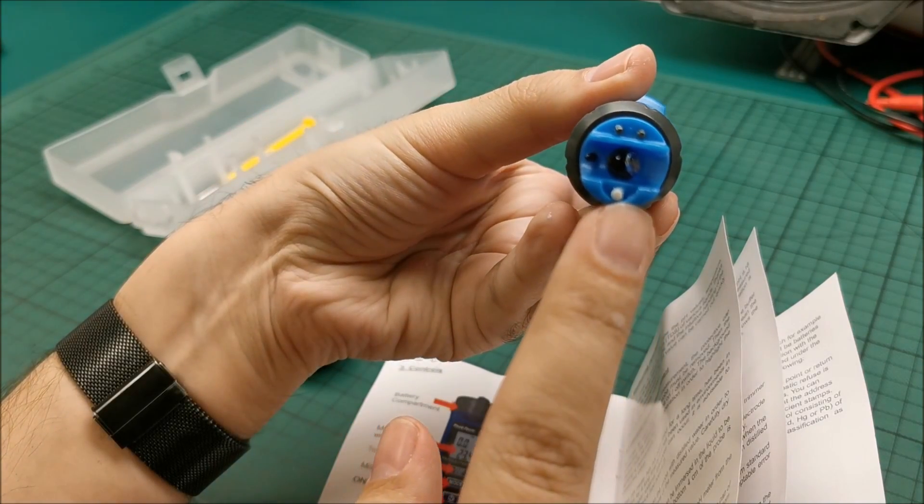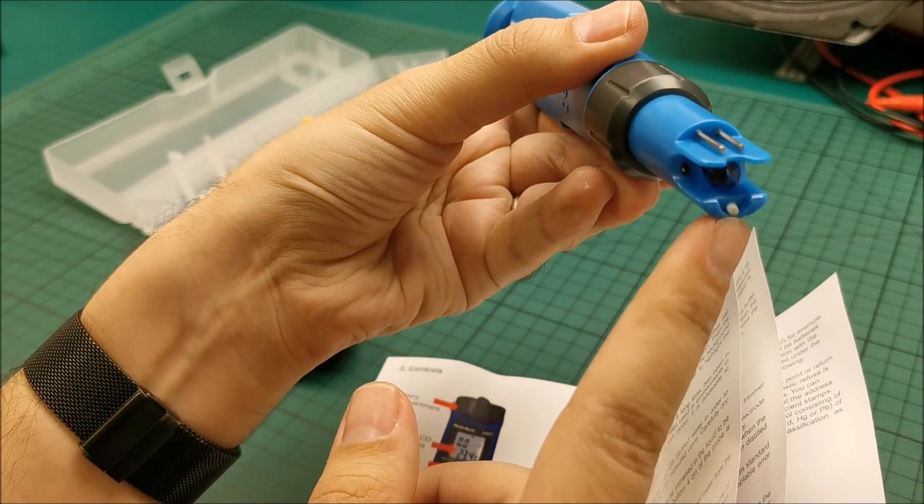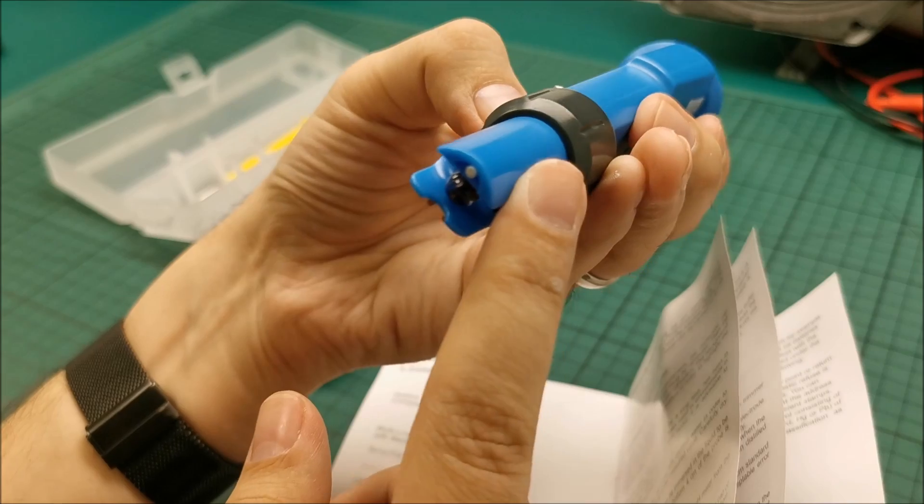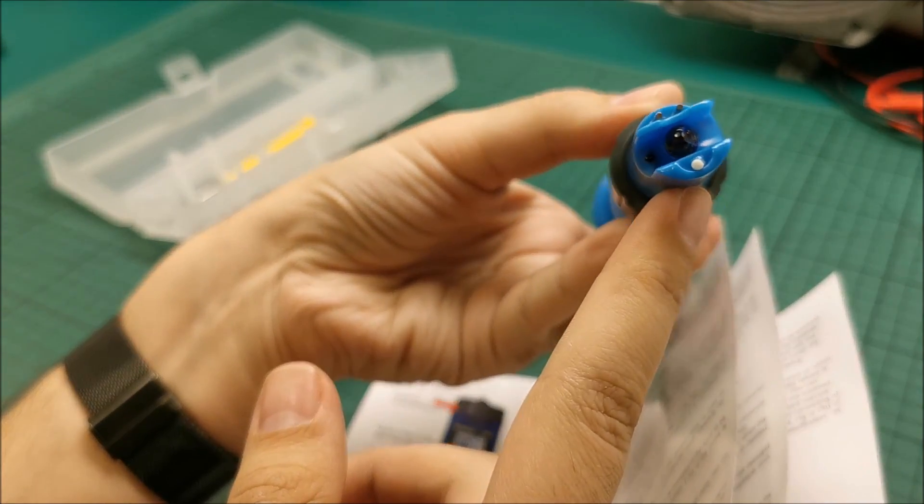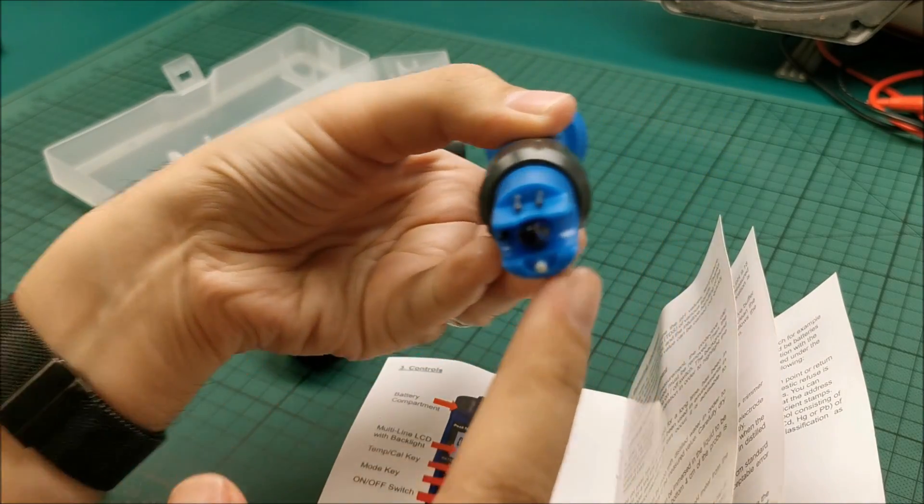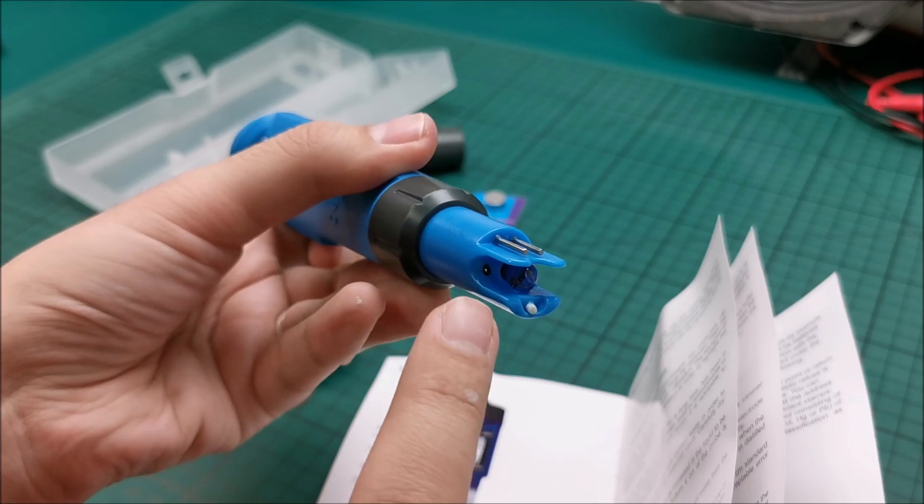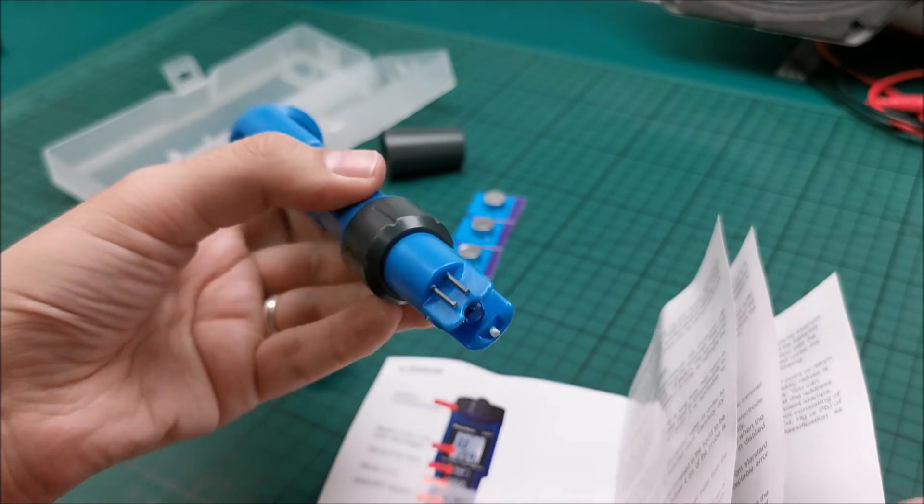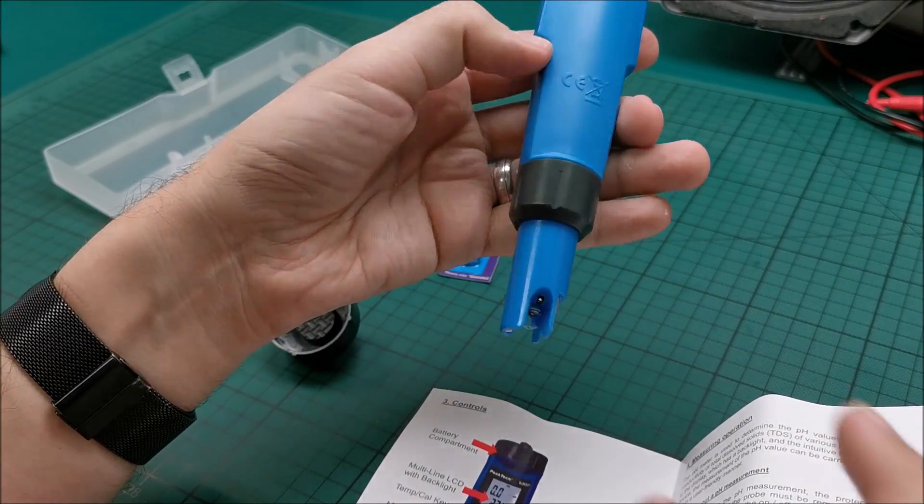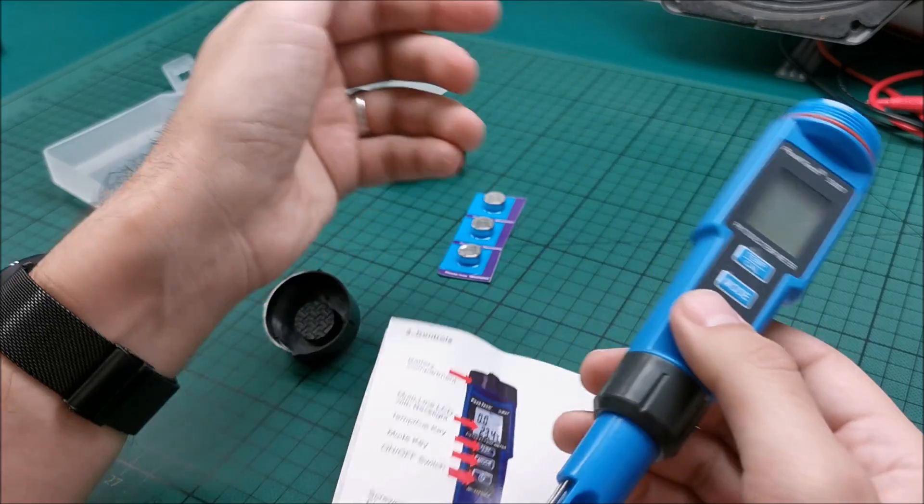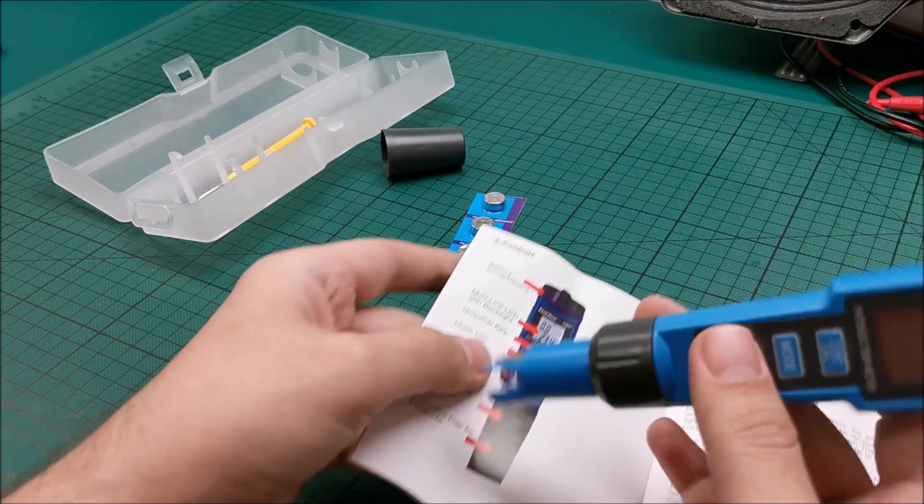The tiny white one, couldn't tell you honestly. That one I'm not sure about. The manual doesn't give you exactly which of these sensors do what. Anyway, so there's that. At this point in time, let's put in the batteries.